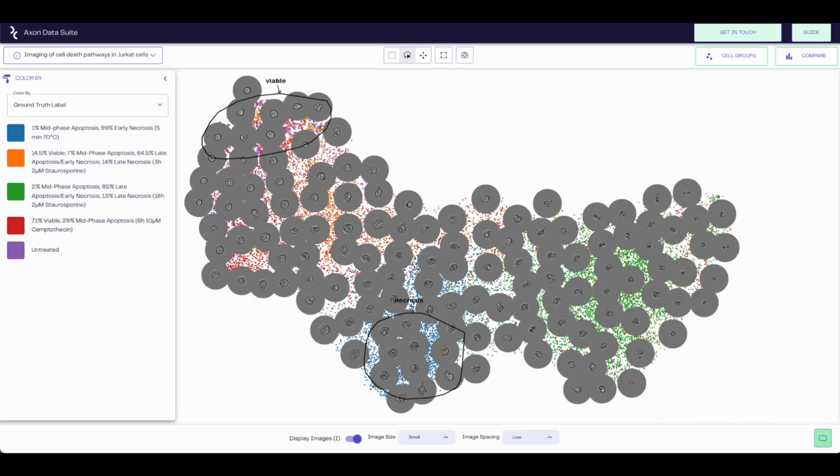An exciting aspect of the REM-I platform is that now that the cell groups have been defined, we can sort viable cells from each group for characterization using functional assays. This gives us the ability to study the connection between phenotype, molecular, and morphological cell states.